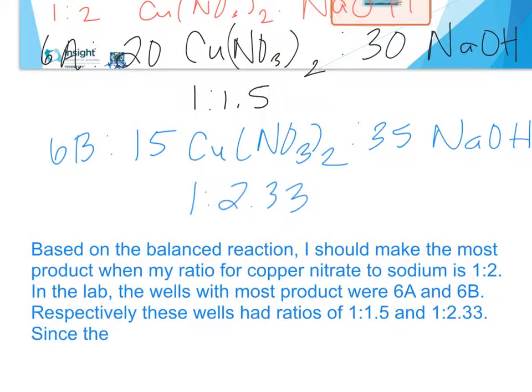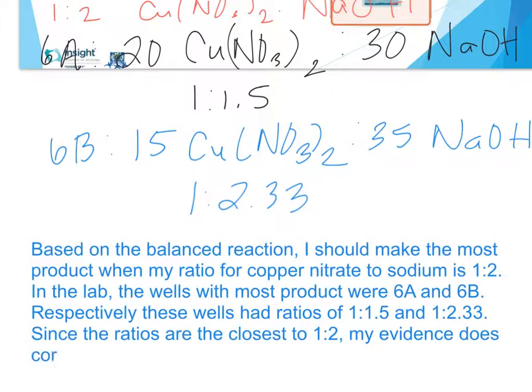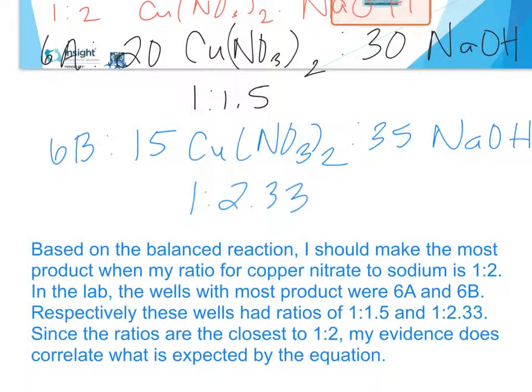Since these ratios are the closest to 1-to-2, my evidence does correlate with or match what is expected by the equation. And then you would do that again for each part of the lab. I did the first one for you, you got to do the other two.